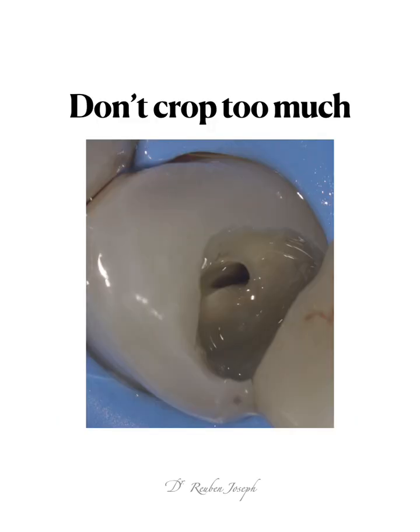This is another mistake among microscope users. What you have to understand is, unless and until you have a good documentation set up, if you are going to crop the image too much and try getting too deep into the area where you want to explain something, the image is going to get blurred. So if you don't have a great documentation set up, I would recommend that you do not crop your image too much.